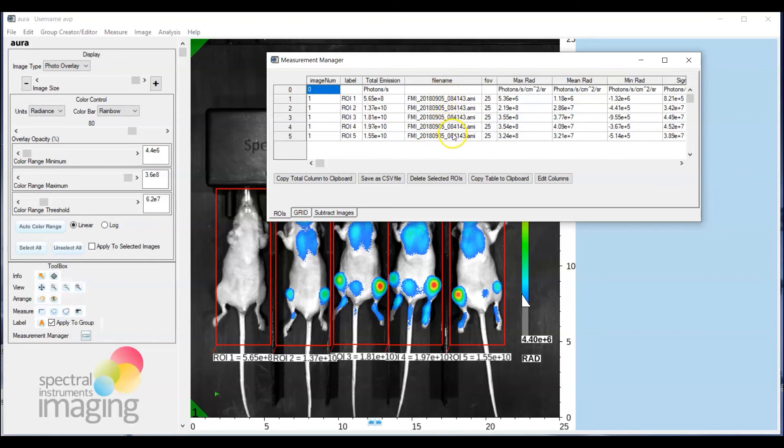You also get a bunch of metadata details with regard to each image acquired along with some additional quantifications of signal as max radiance, mean radiance, min radiance.